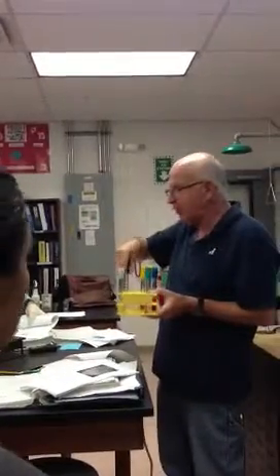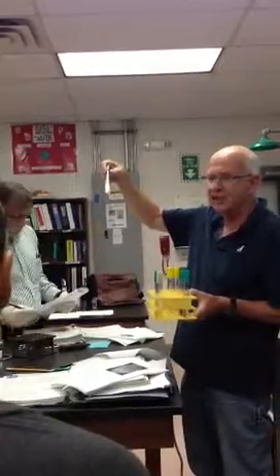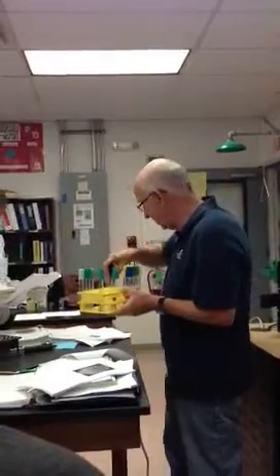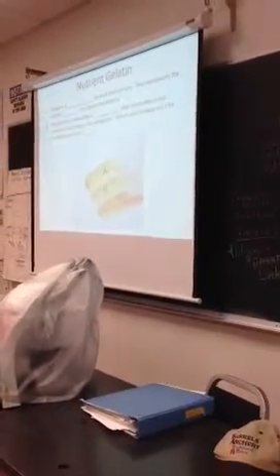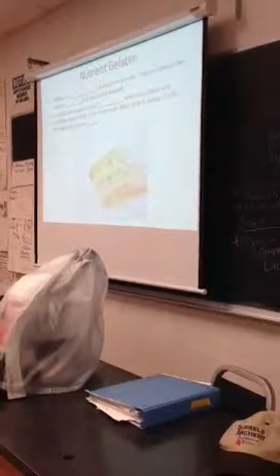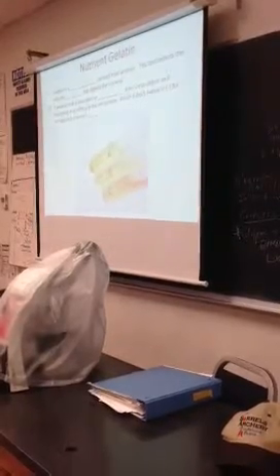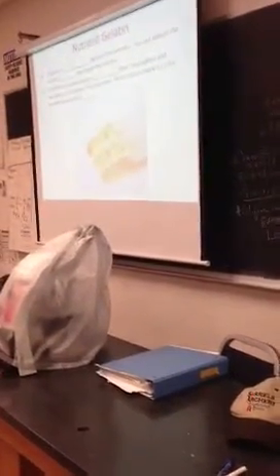Okay, gelatin is a protein. If the organism grew, and you can see it grew there at the top, it's digesting that gelatin like crazy, and so it's no longer solid. That's a positive gelatinase. Gelatin is a protein derived from animals. The test detects which enzyme? Gelatinase. A positive test is liquid after inoculation, incubation, and refrigeration. So which two below are positive? B and C. Which one is negative? A.